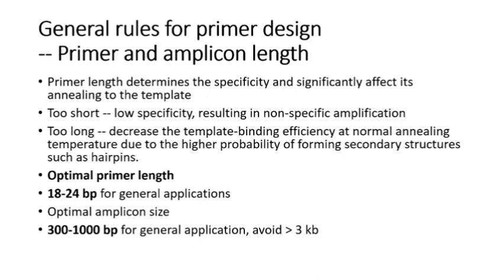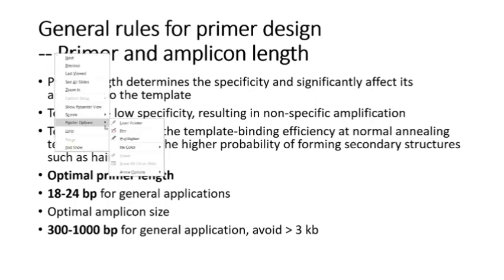Or maybe, if you have a DNA synthesizer in your lab, you can synthesize yourself. So primer designing is an important tool while you are studying a particular gene. So you should follow some rules while designing a primer, that we will discuss first, and then we will design a primer using Primer3 software. That is what we are going to study next.